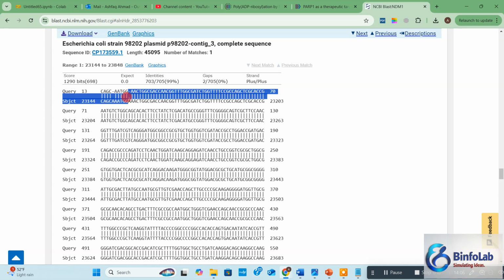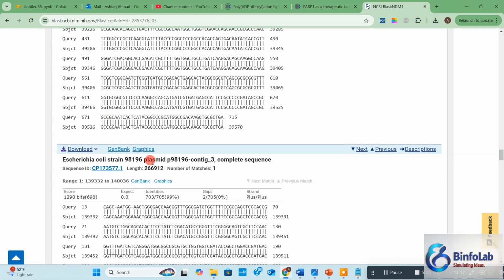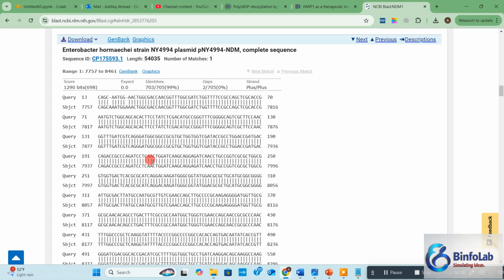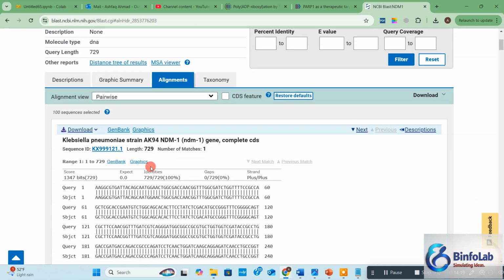If you don't know the indel operations, then please watch the second lecture of this series. Okay, so this was how you can interpret the BLAST results.